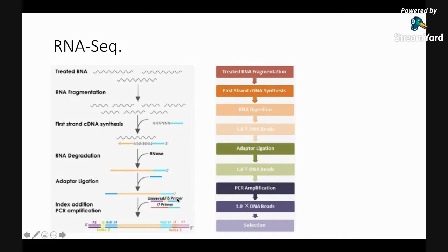So this combination has to be unique for every sample. Yeah? But in addition, you have this universal tail. Yeah, and we will go into why you need this universal tail, right? But this is the important thing. Your cDNA is not naked cDNA.